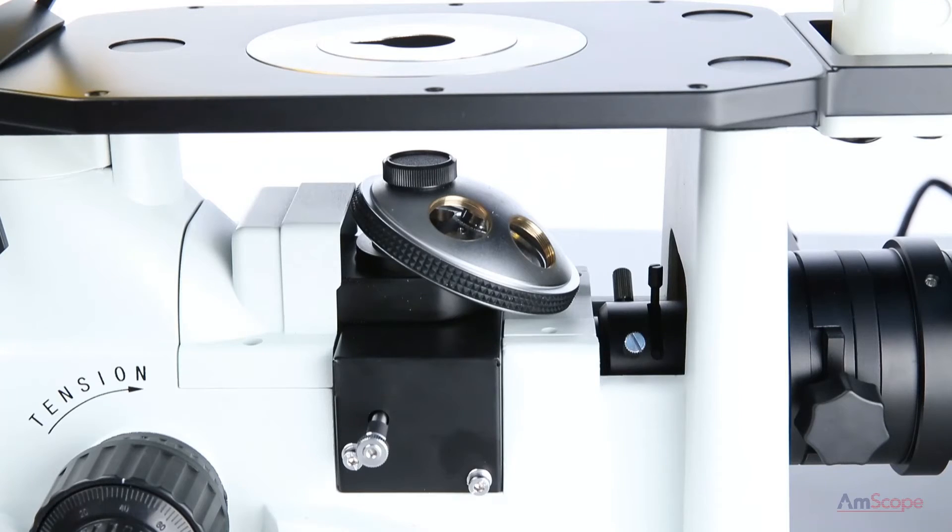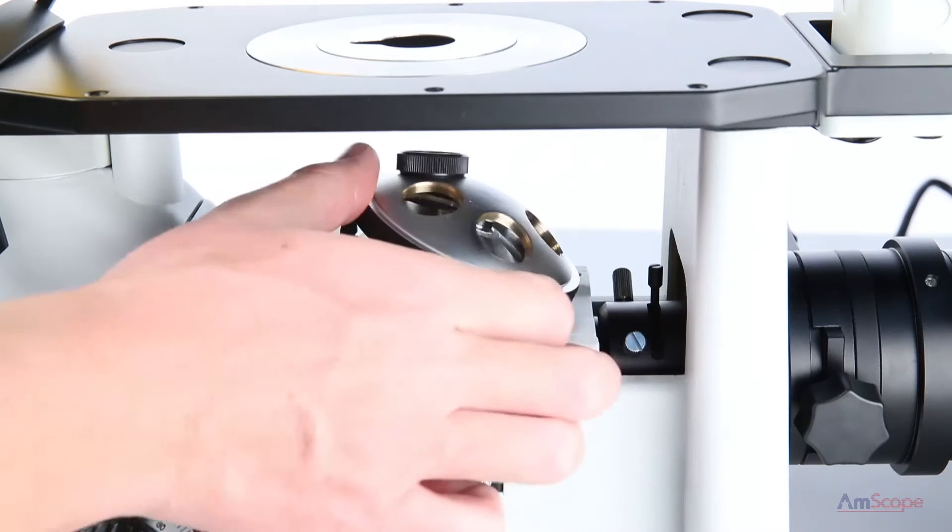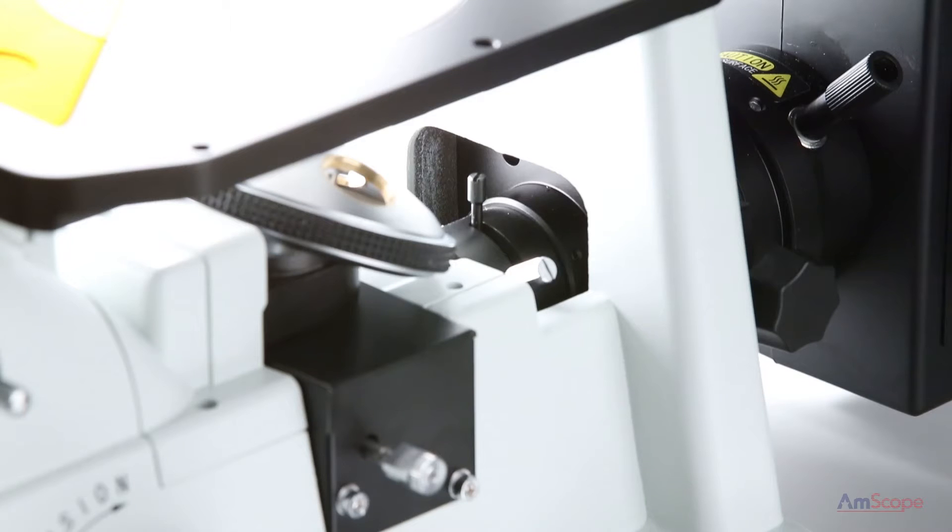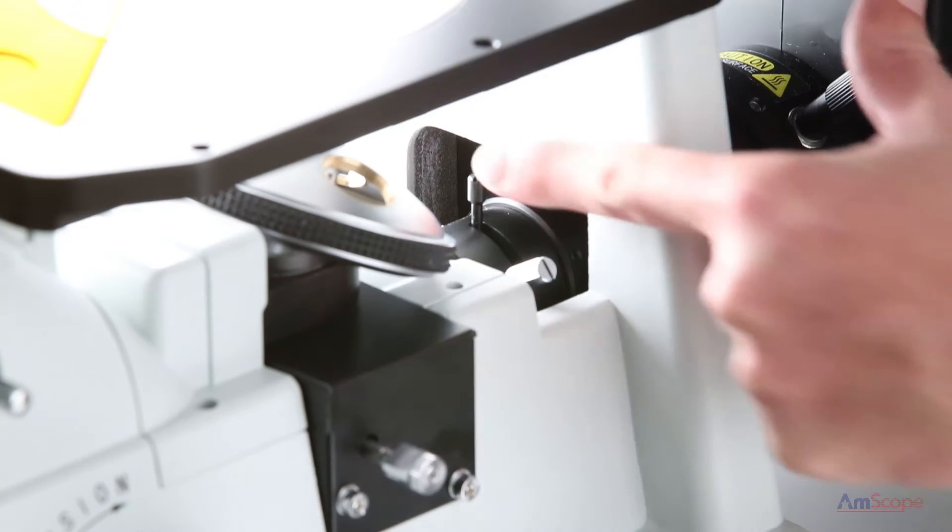Move the nose piece to an empty port. You may have to remove an object to do this. You may also want to open up the illuminator's diaphragm.